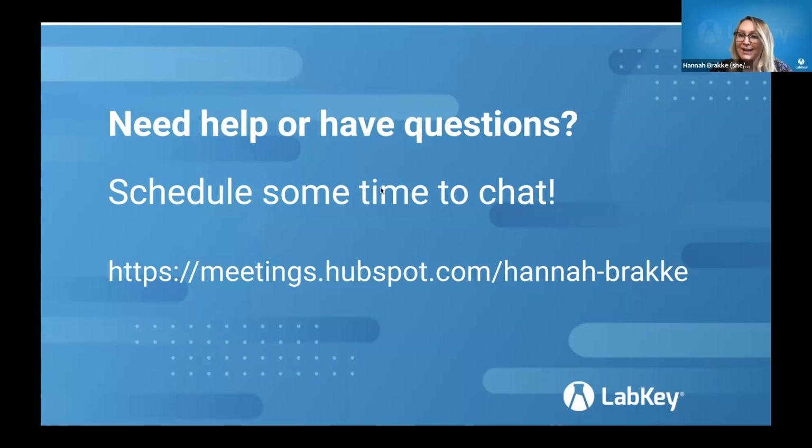I know that Tristan mentioned that they were using pick lists for that, but workflows really give you that notification component if that's desired as well. Steve, I'm not sure if there's other scenarios there that you wanted to touch on. Really, they give you a way to do anything from a really formal protocol or SOP. They give you a way to track that, or to track things that are really more quotidian or just daily, like, ship these samples or put stickers on these samples, that kind of thing.